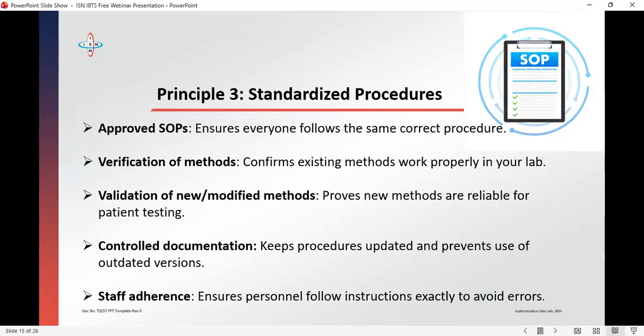They write it. Once they write it, they send it to the lab manager for approval. After it has been approved, you test it for a period of time. Then you issue it out and do a training for everybody. This is a requirement, and you should continuously monitor that standard operating procedure to establish its efficacy. It is required annually to review your SOPs, whether they are still valid. It is not, "Yes, I have written the SOP, and that is the end." Something may change and you need to update it.